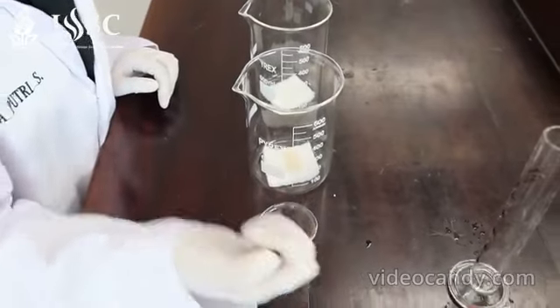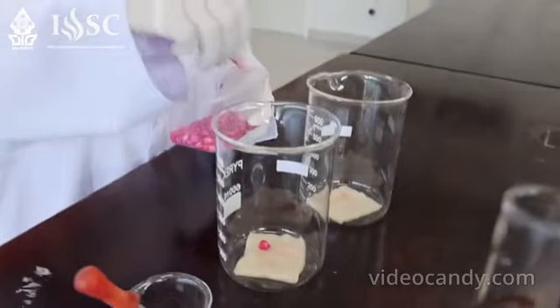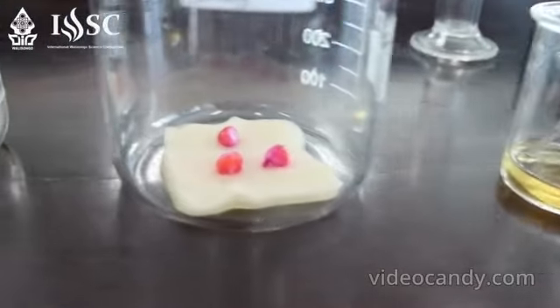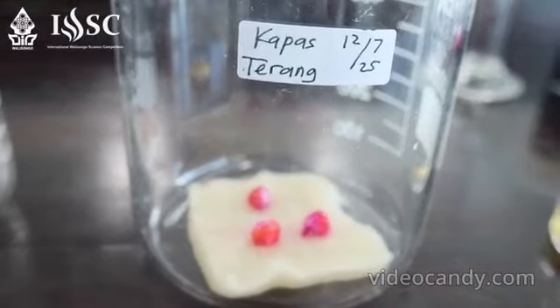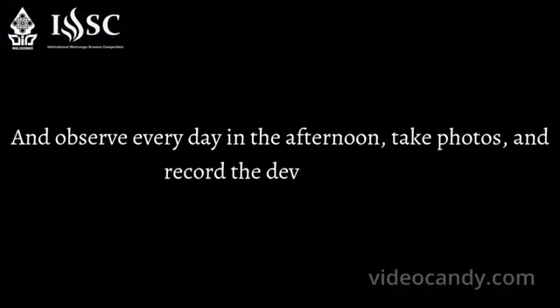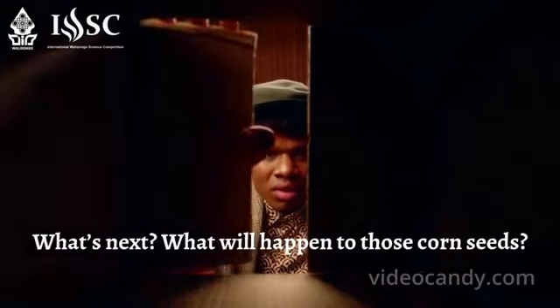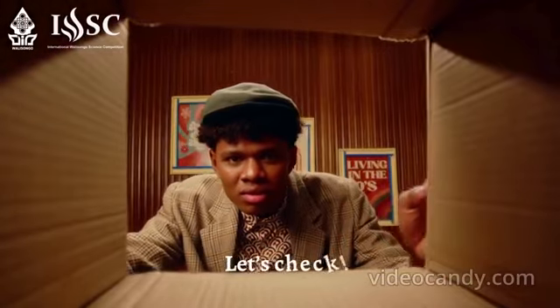evenly distributed. Next, place 3 corn seeds on top of the moistened cotton. Finally, place 1 beaker glass in a light location and the other in a dark location, and observe every day. In the afternoon, take photos and record the development. What's next? What will happen to those corn seeds? Let's check.